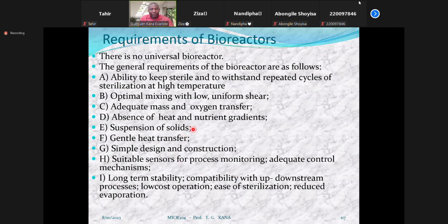You're going to have sensors such as a temperature probe, pH probe, dissolved oxygen sensors, carbon dioxide sensors, different mineral salt sensors, nutrient sensors. All those sensors will capture information from the reactors. Then you need to have actuators. Actuators will act like the valves opening or closing. Like the motor mixing the entire system, these are actuators. So you have a combination of sensors and actuators found in the system.